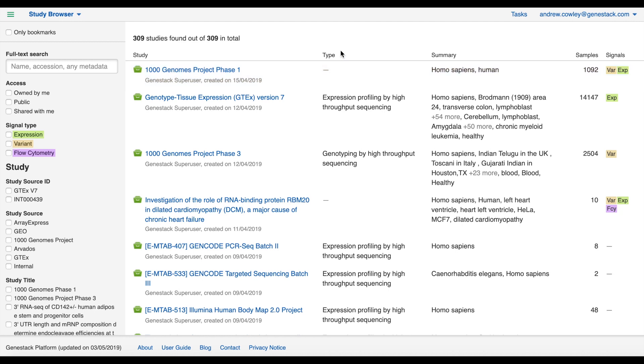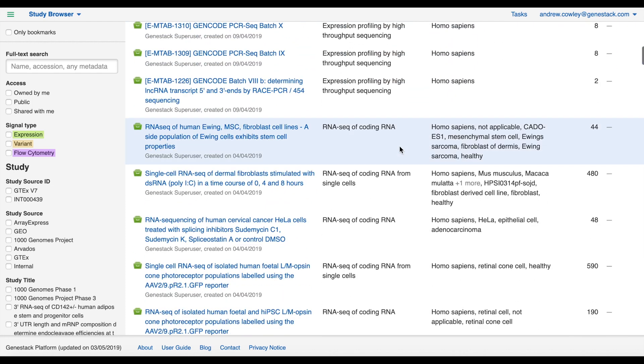The next column shows the type of the study. If there is information about the general type of study, for example expression profiling by high throughput sequencing or RNA-seq of coding RNA from single cells, then it's displayed here.